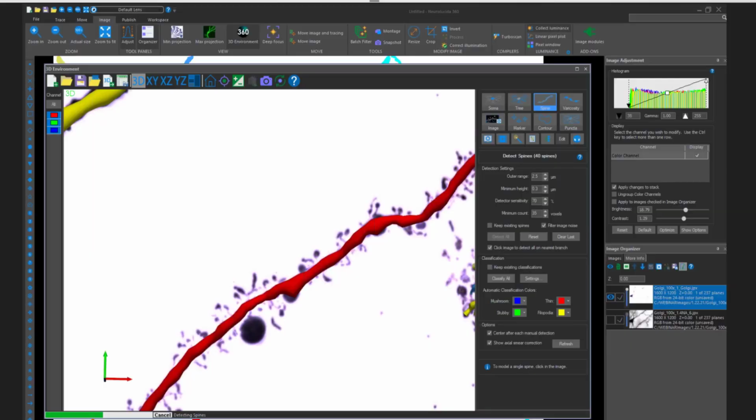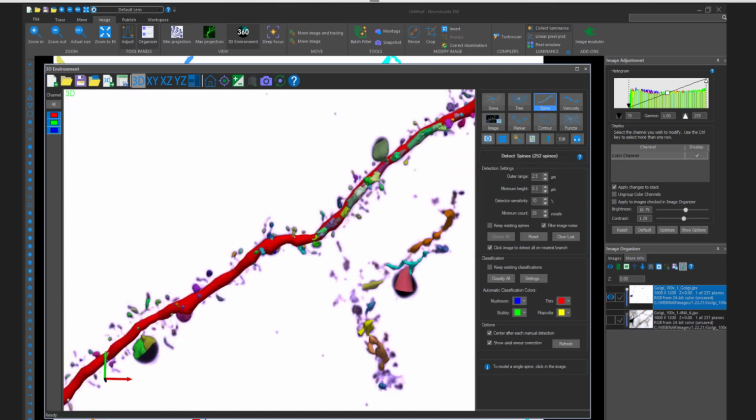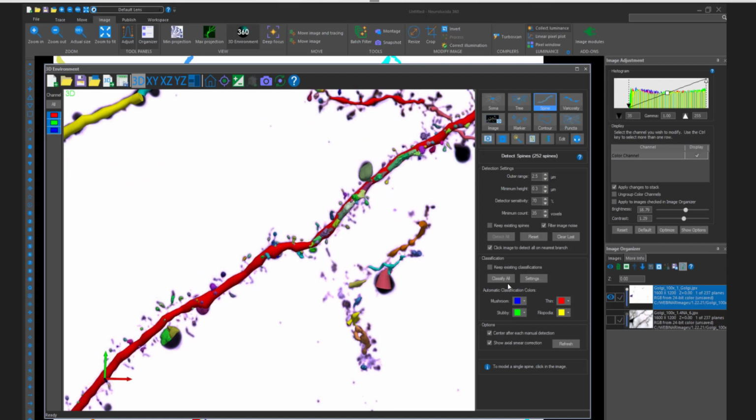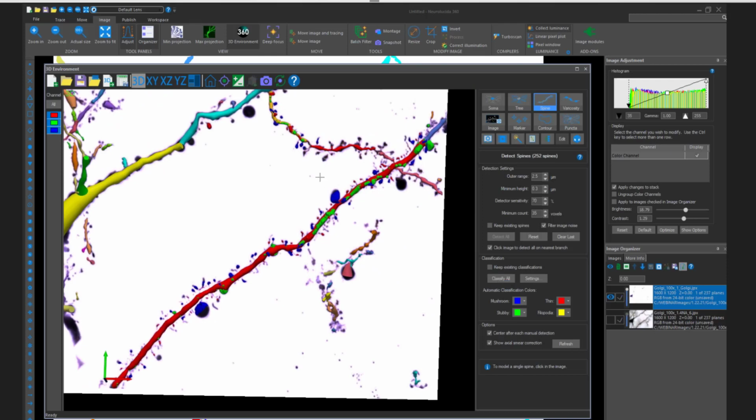One thing that I do want to talk about as it's running through detecting these spines is that back in February of this past year, we had the privilege of working with Dr. Patrick Hoff's lab, and more specifically, a scientist named Carmen Freire-Cobo, and she was looking at hippocampus and prefrontal cortex in marmosets, which was extremely interesting to work with. I'm going to click the classify all, and you'll know why I'm talking about this after this classification.